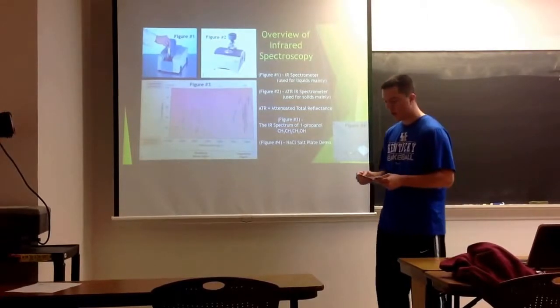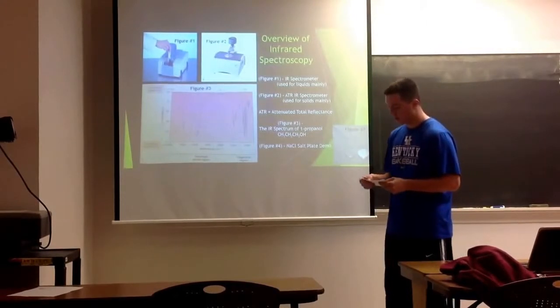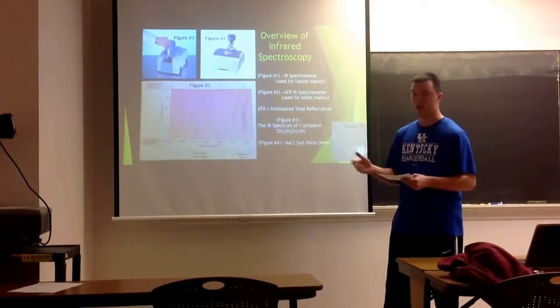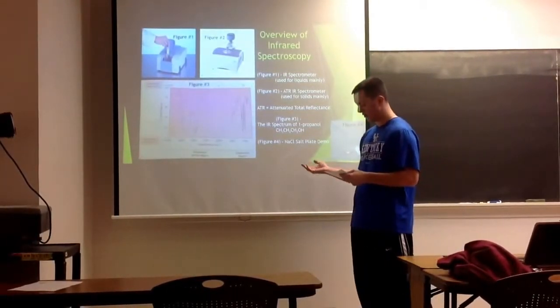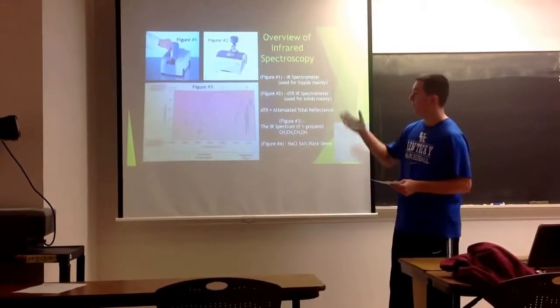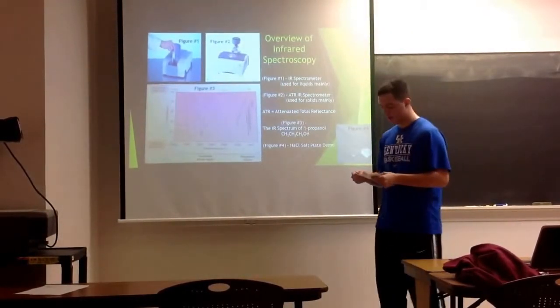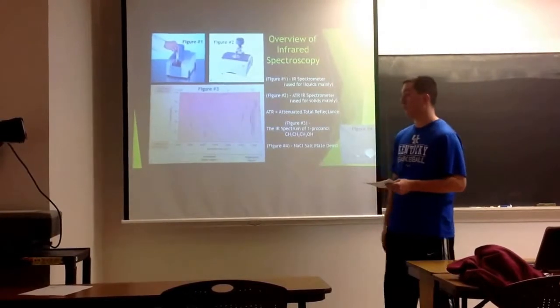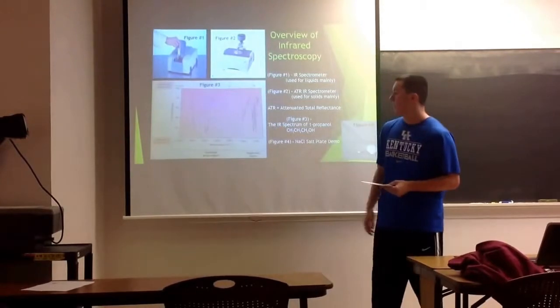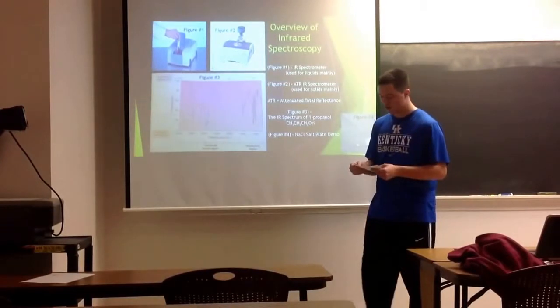When organic molecules absorb radiant energy in the IR region, specific bonds within the molecule become excited and vibrate. If the frequency of that incident radiation matches the specific vibrational frequency of the bond, it is excited to a higher vibrational state, and the amplitude of that vibration will increase, like these two right here, and that's where you get your major peaks. Structurally different molecules will not absorb at the same energy. So, for instance, if another molecule didn't have that OH bond, this absorption right here will not be present, and you will know that it doesn't contain an alcohol.